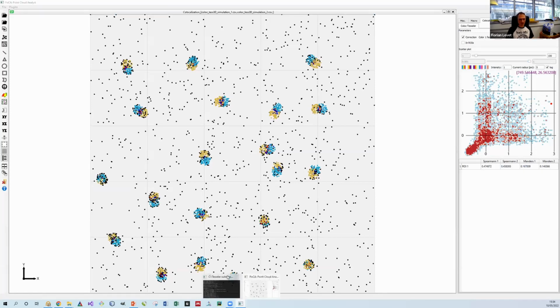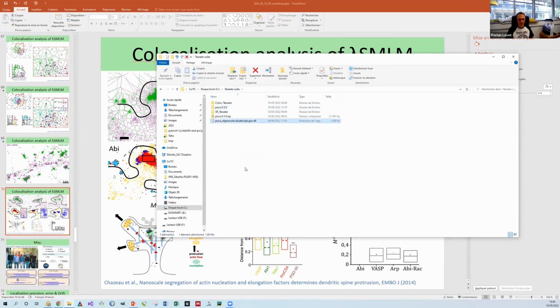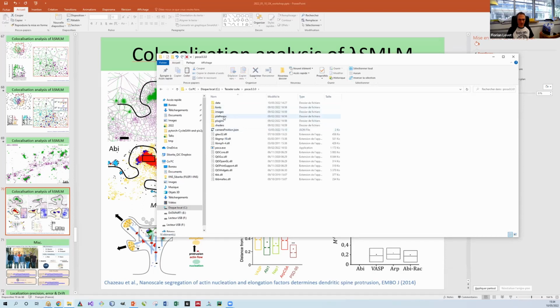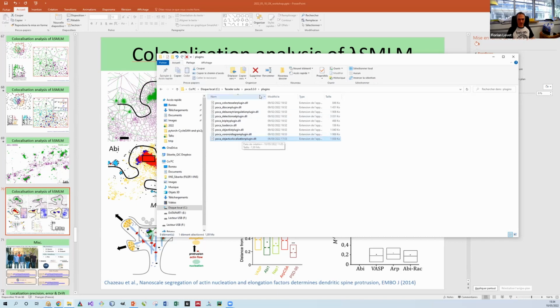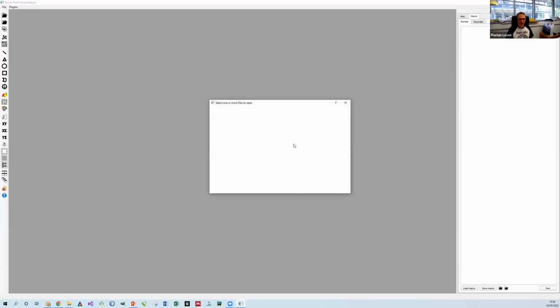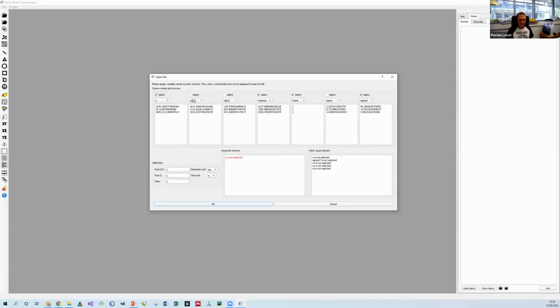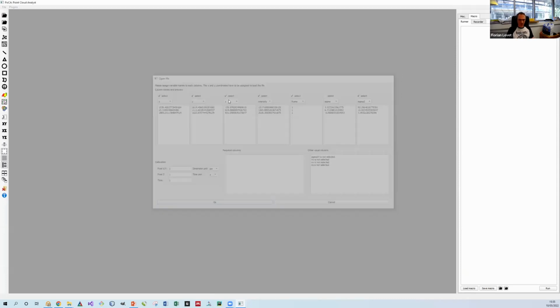And the last thing I want to show, which is really ongoing, so not available right now on the GitHub, is that PoCA is now a plugin architecture. So I have done something in order to compute the object localization. I put this plugin in the plugin section. I add that. I will just open again the two data in 3D, and I will end up with that. So it will be pretty fast.